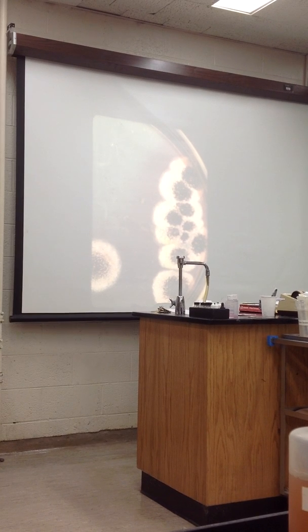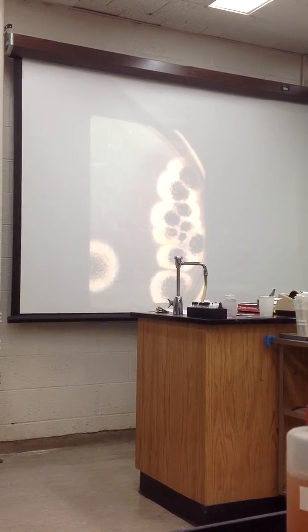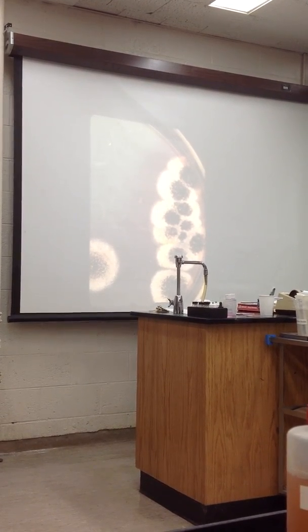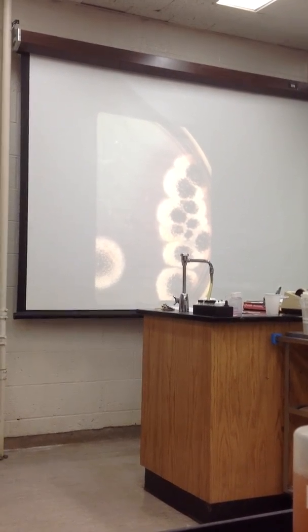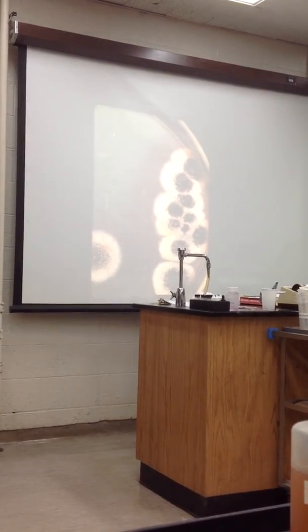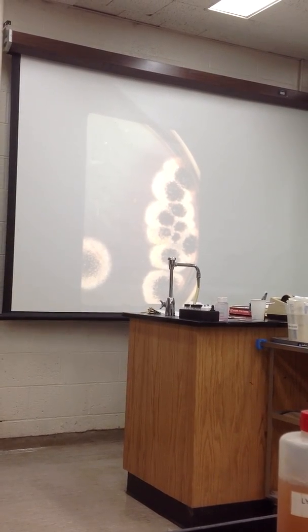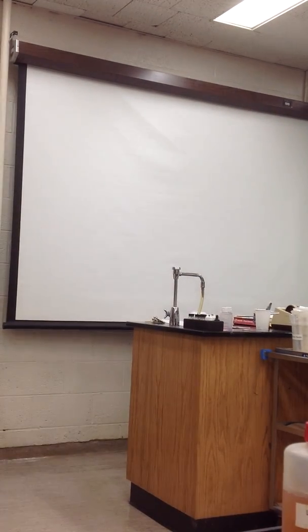Mold. You find that in the bathroom, and you know that it is black. So therefore you would identify it as Aspergillus niger. Aspergillus niger, spelled N-I-G-E-R. It's a mold, but it's identified as Aspergillus niger. Niger's black.